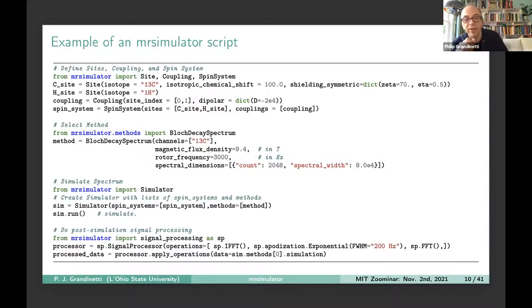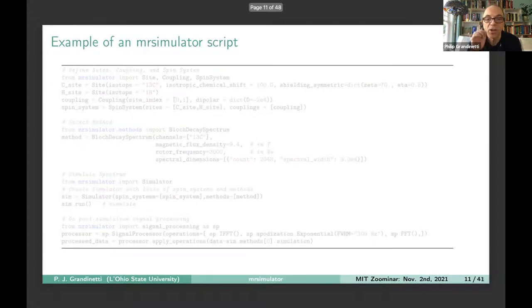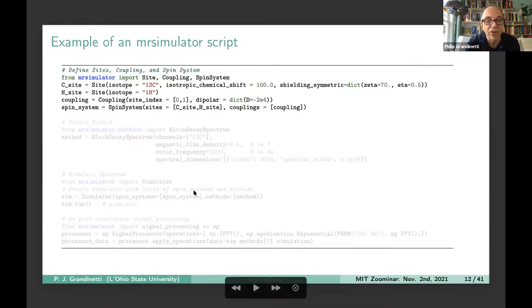Okay, so here's an example of one script. I'm just going to go through this section by section to show you how you could use MRSimulator and how easy it is. In these first few lines, this is a comment up here, we're just defining sites, coupling, and spin system. We're going to grab the site object, the coupling object, and the spin system object. And with the site object, we're just going to create a carbon site. You can see the arguments that we have to put in are pretty obvious. If you're in the NMR field, you understand what's going on here. If you create a proton site, you just create the proton site. If you don't put in the parameters, it just defaults to zero for all those parameters. So in other words, we're putting in a proton site with an isotropic chemical shift of zero.